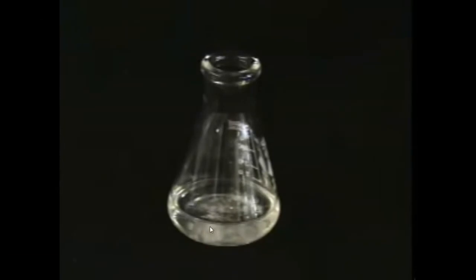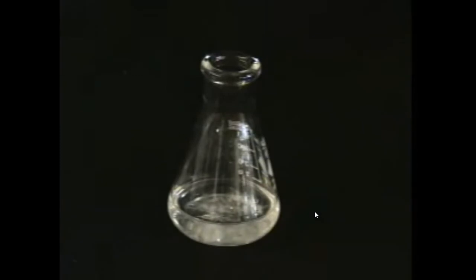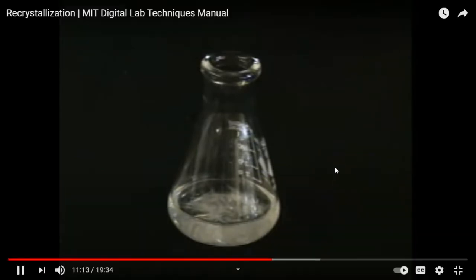Ideally, crystals will begin to form as the solution cools. You may want to watch. It can be very beautiful. It's beautiful. Yes, I agree. I can imagine those little molecules coming near the crystal and finding best positions and feeling most attractions and stabilization, and stack up and keep repeating, coming into the feather-looking crystal.